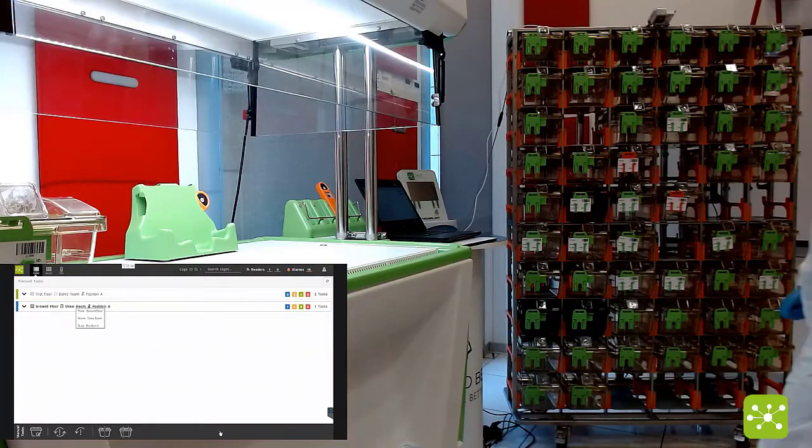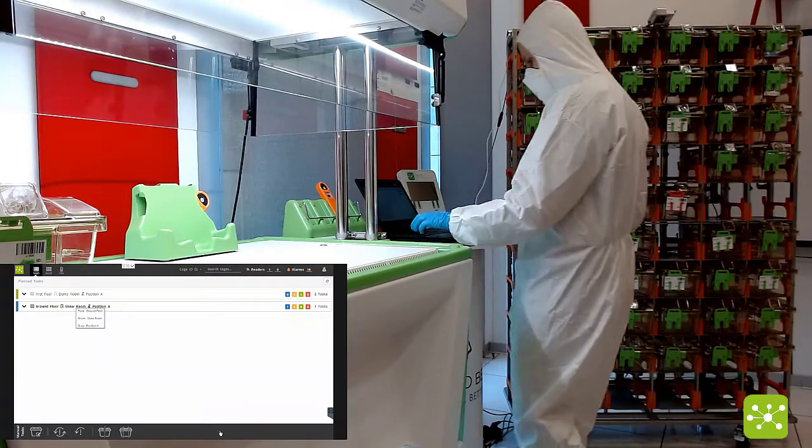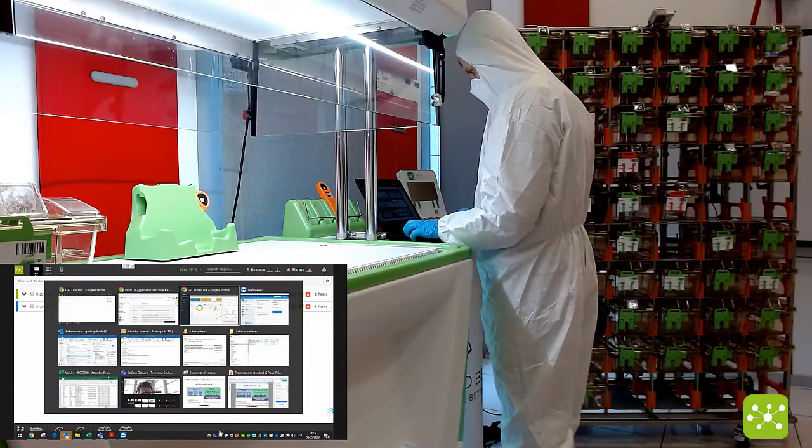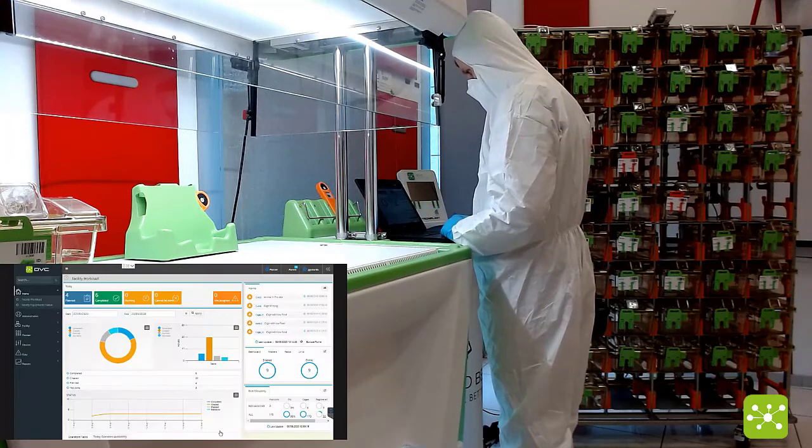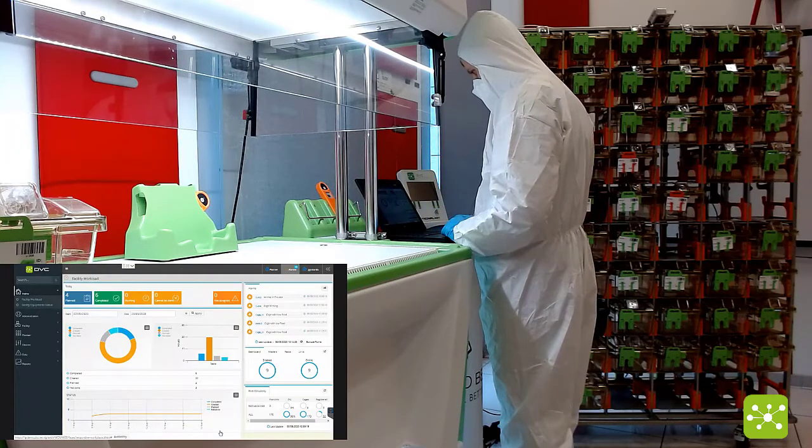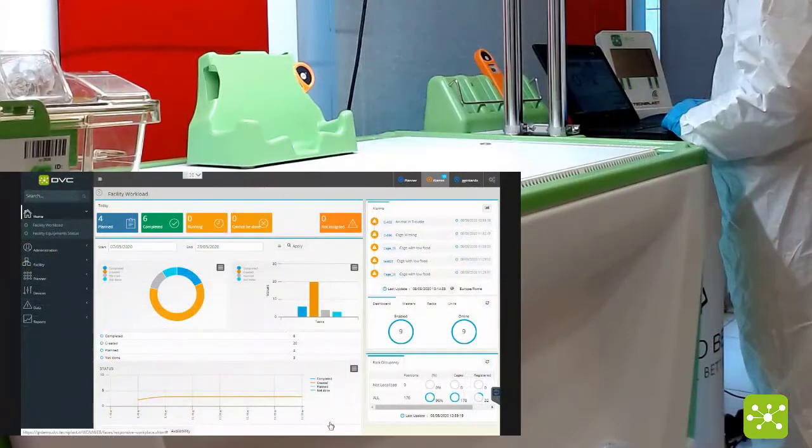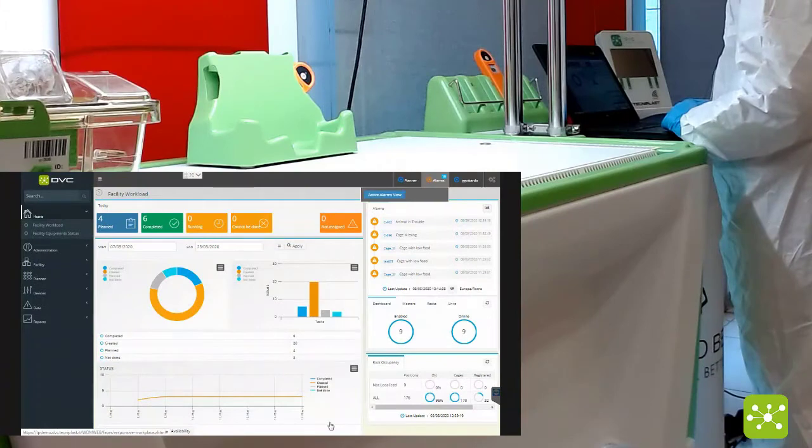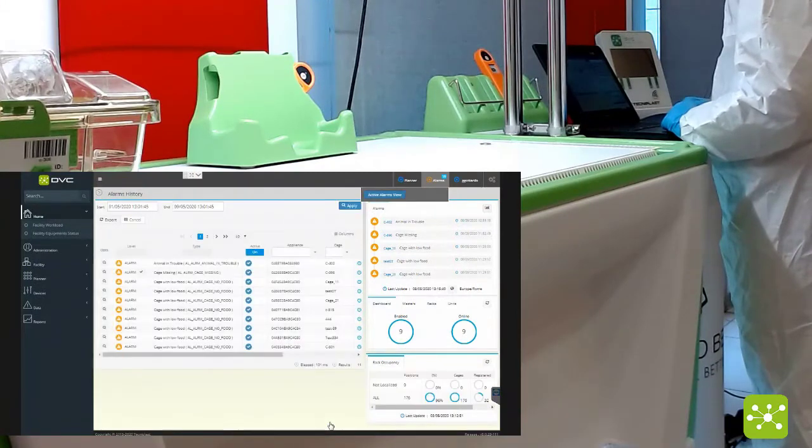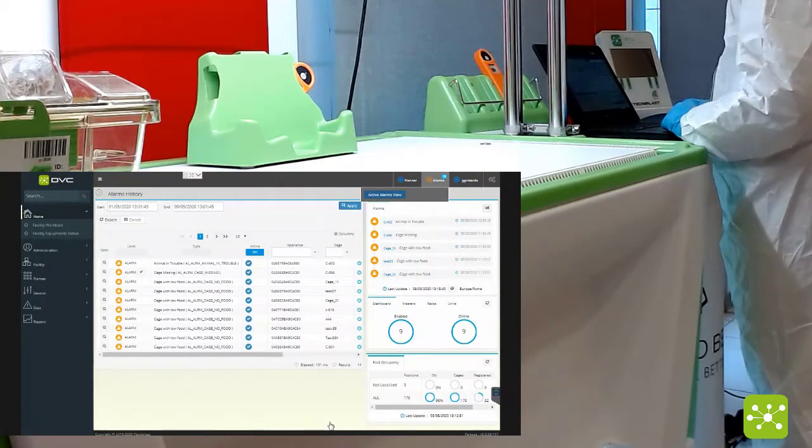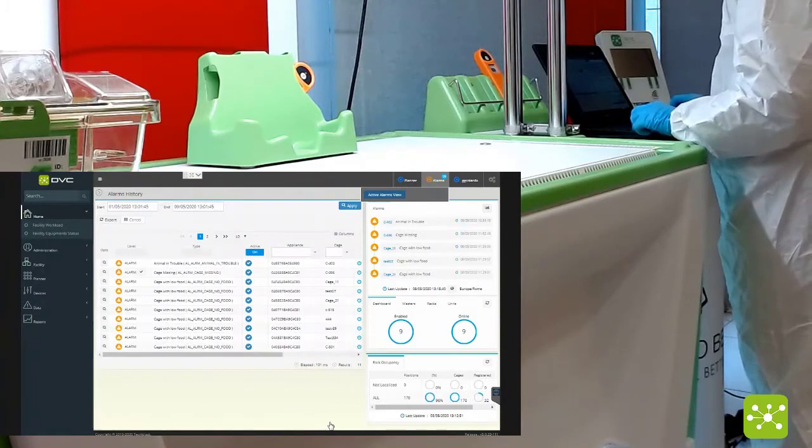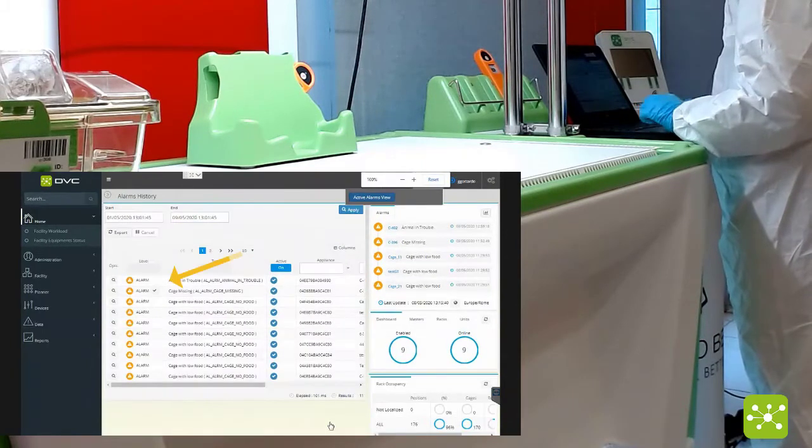After 12 hours, this cage will be declared missing and if you enter the workplace interface, there will be a new open alarm: missing cage.